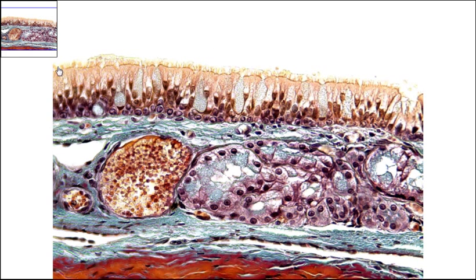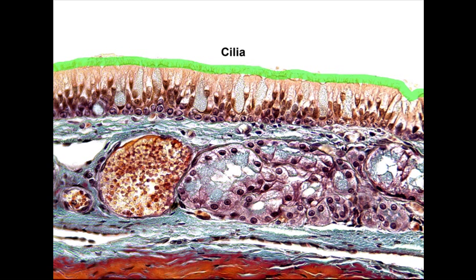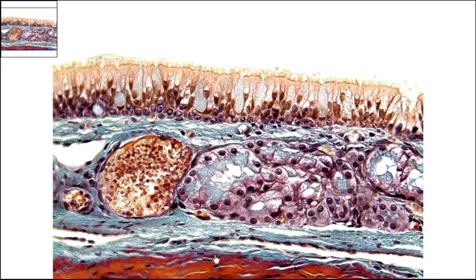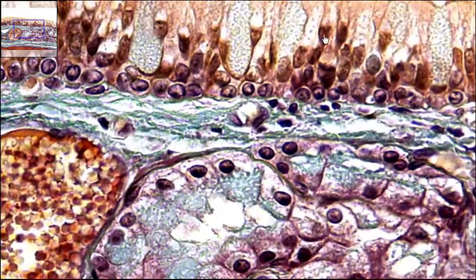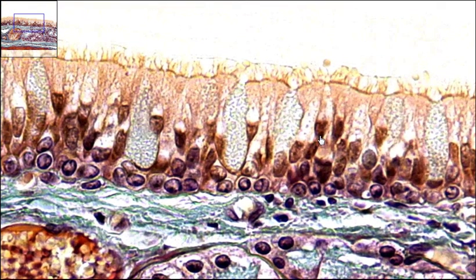On the apical surface up here — that's the surface that's exposed — you can see these cilia, all these tiny little hair-like projections. If we zoom in here, you can see the nice detail of the individual cilia.